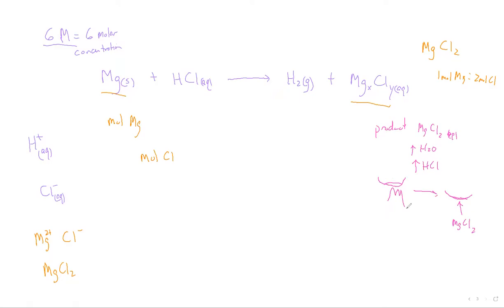And so we can weigh the magnesium chloride, and then get that mass, right? We have the mass of magnesium chloride. And if we subtract the mass of the magnesium, then we'll just have the mass of the chloride. And then we can convert that into moles of chloride. And then we should have the mole to mole relationship. Does that make sense? So that's what we're going to do in the lab.